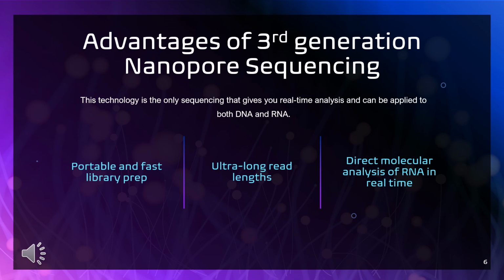Oxford makes another device called the Voltrax, and this is something that they're working on, which gives you automated sample prep. This means you can sequence samples anywhere with fewer lab skills or devices needed compared to traditional library prep, which requires many other steps.